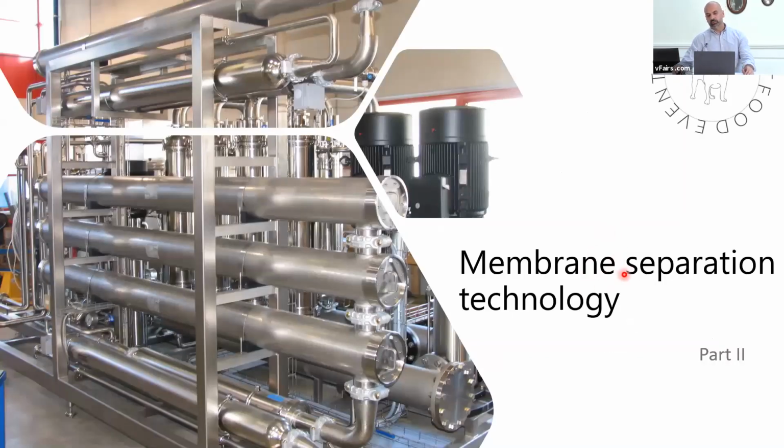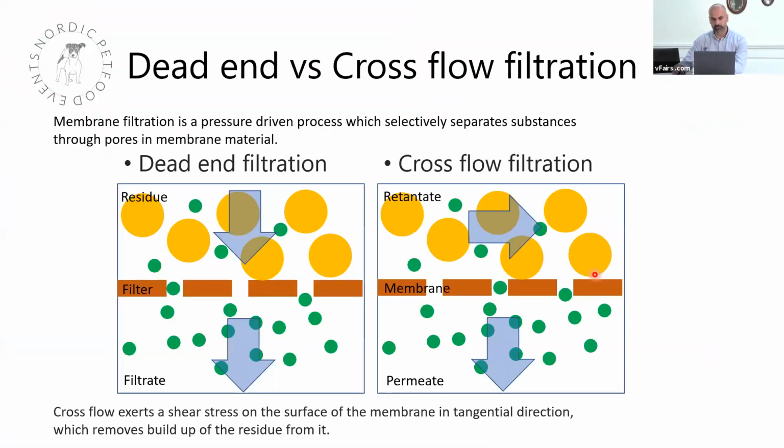So in part 2, I'll show you a little bit about this membrane separation technology. So it's actually what Duemilio is about. We are designing those systems for various applications. So in this slide, at the beginning, it is important to explain the difference between dead-end filtration and cross-flow filtration.